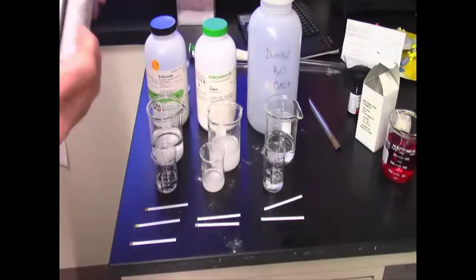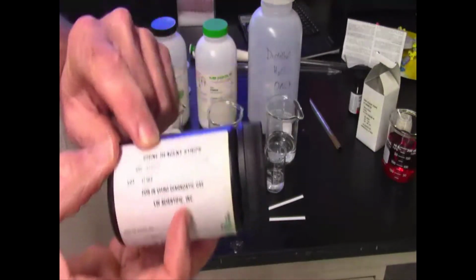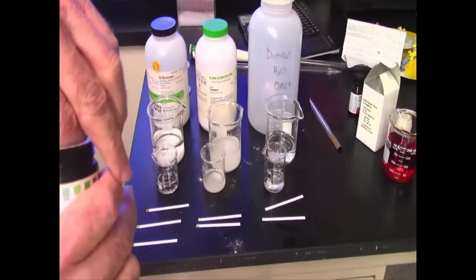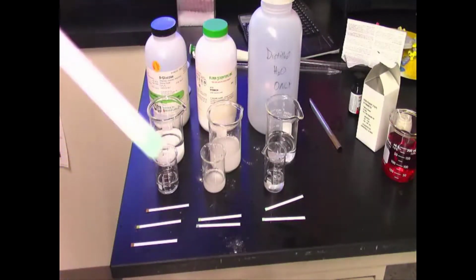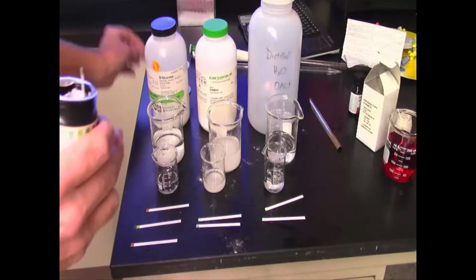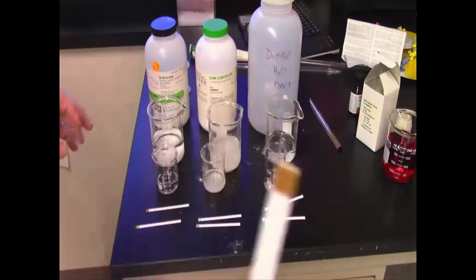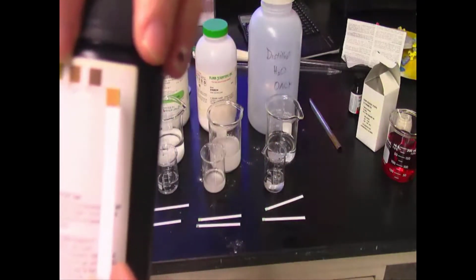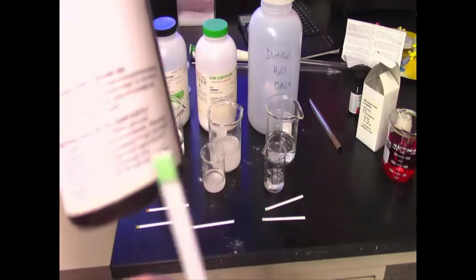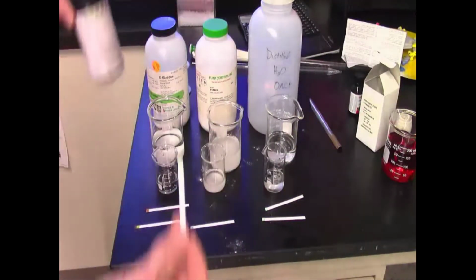Urine reagent strips, and so people that have diabetes often have glucose in their urine, so we just buy these strips and we use it here. So take a strip, a urine strip for glucose, looks like this, it's nice and green, and I dipped it in the solution with glucose just to see what it's like, and I got this result, which according to the bottle means that, yeah, there's quite a lot of glucose in that solution. And then this is a strip that I put into the starch solution, and it started and ended about the same. So there's basically no glucose in the starch solution.